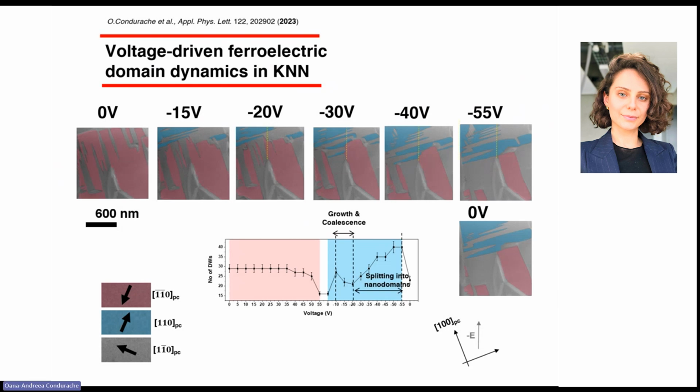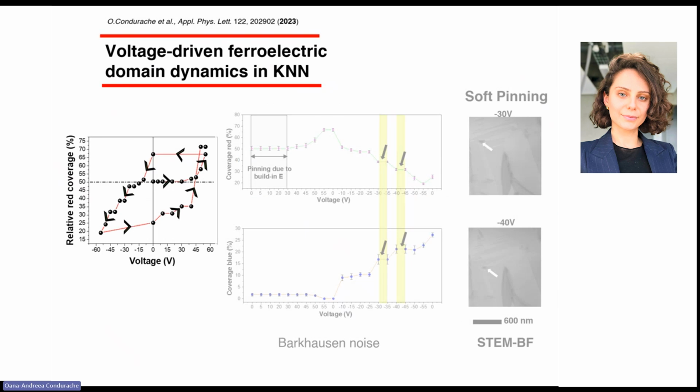And other interesting observations is that we have nucleation from the edge of the sample. This shows how important are interfaces and surfaces in a microcapacitor. And also around the non-edge domain wall, we have random pinning of an area about 300 square nanometers, irrespective of the direction of the polarization or the direction of the electric field.